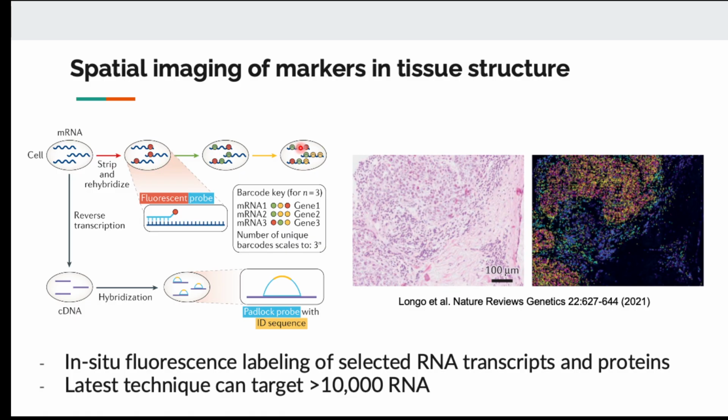But if you let all the probes bind at once, you are not going to get many different signals, right? Because you're going to get green yellow yellow, or green yellow red. When they are close to each other, you might not be able to distinguish green yellow red from red green yellow. They are probably going to look the same as a combination of three colors.